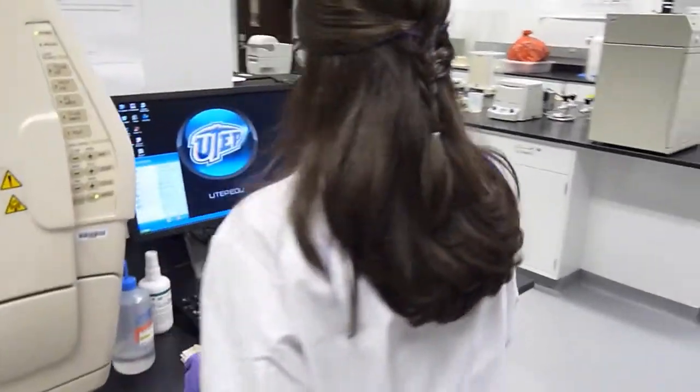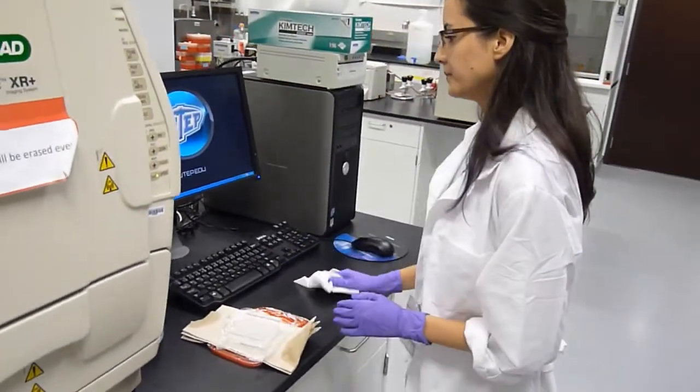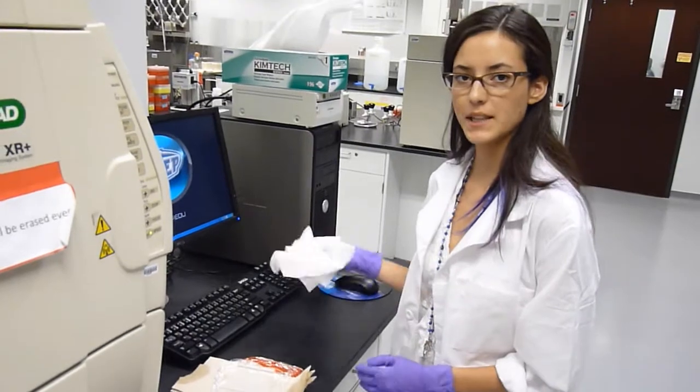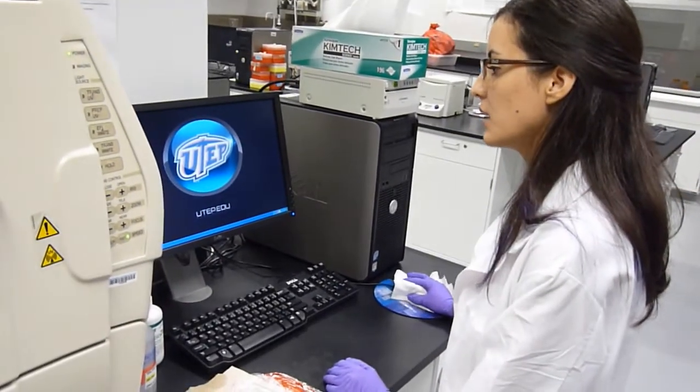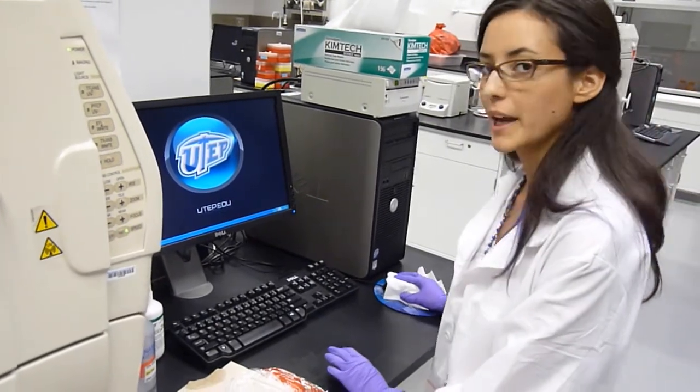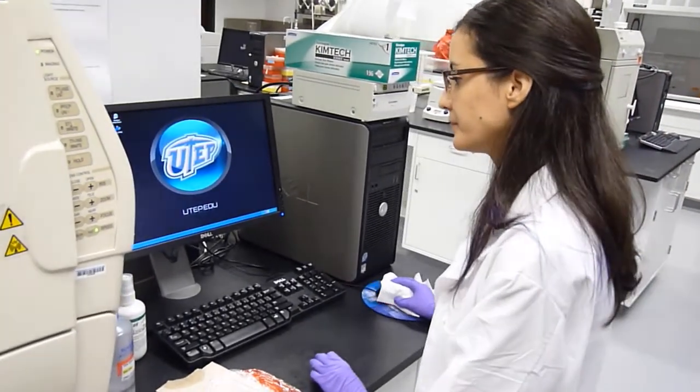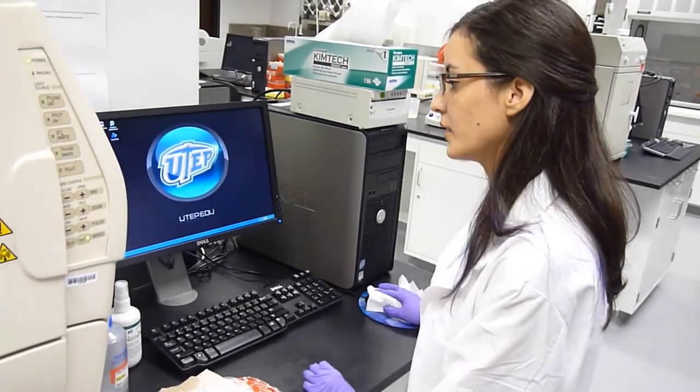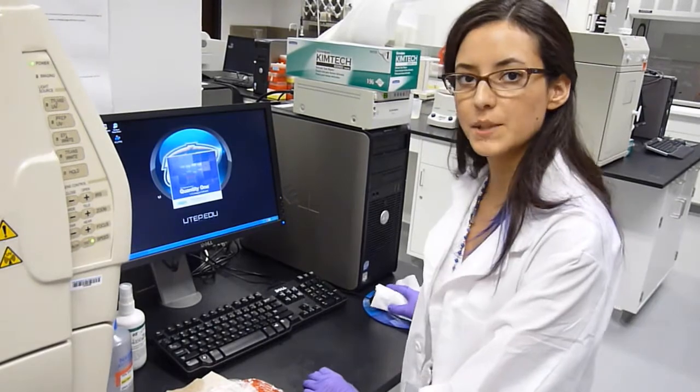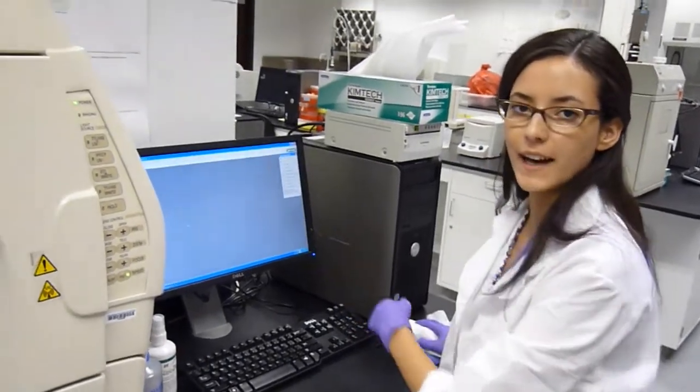Now we're going to visualize our gel. We need to check in before using any instrument. We've already done that, so now we're going to move on to this software. Always use the pen point because you don't want to contaminate the computer. The first thing we do is log in with your miner's username and password. After that, you want to open the QuantityOne software. If you get lost at any time during this process, there's instructions here that can guide you along the way.